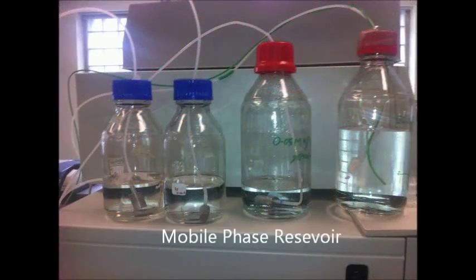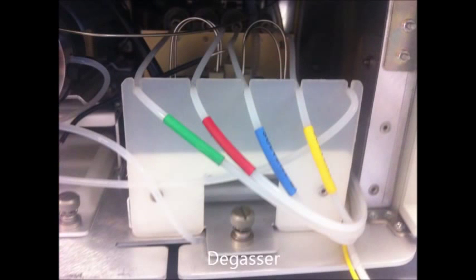The mobile phase reservoir holds a solvent which is referred to as the mobile phase because it moves. There are usually a minimum of 2 reservoirs in a system. There are 4 lines in the degasser which go into the vacuum. It takes the bubbles and entrapped gases out of the solvent before going into the pump.